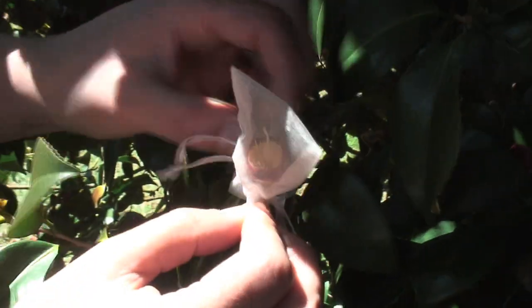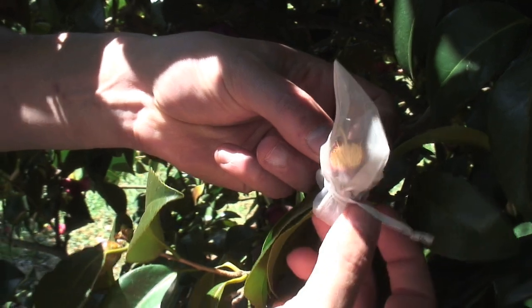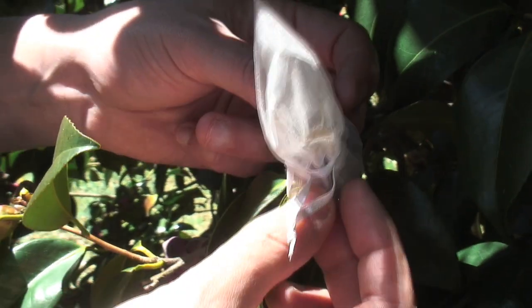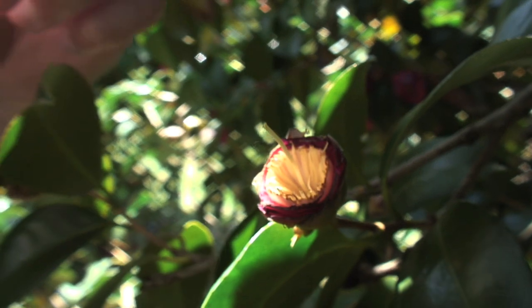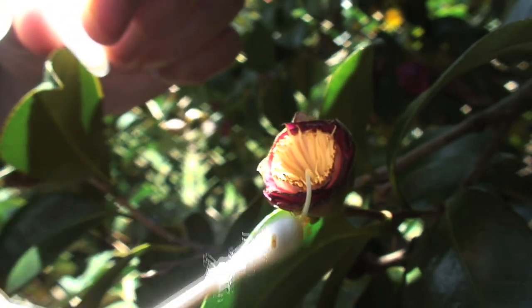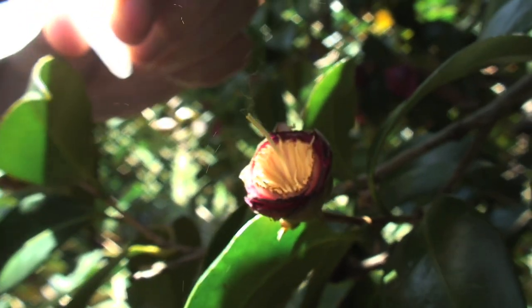Here's a flower that I emasculated two days ago and bagged, so it wouldn't be contaminated with pollen from this plant. Then we come in with pollen from our male parent and just tap it right on the end of the pistil.